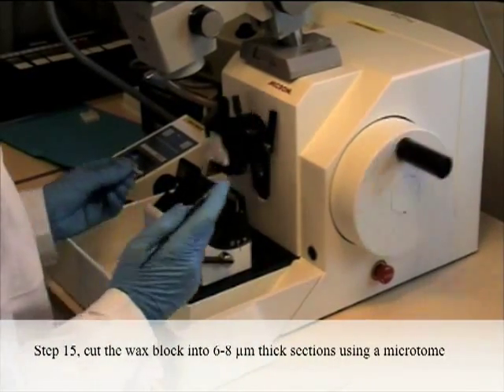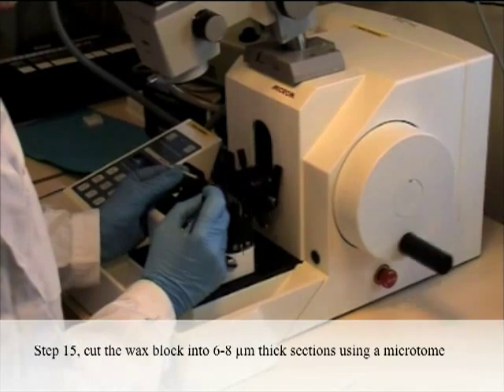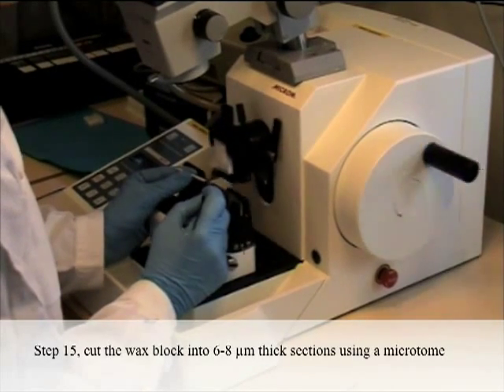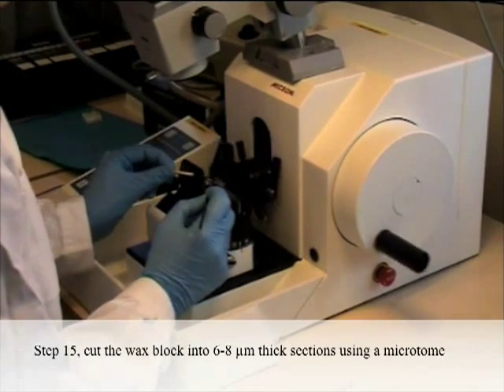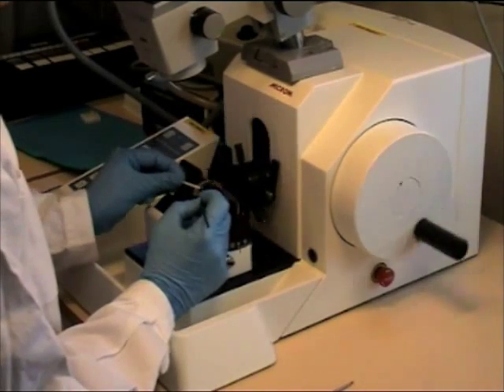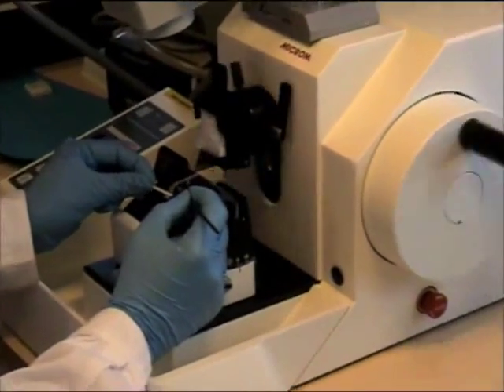Step 15: Cut the wax block into 6 to 8 micrometer thick sections using a microtome. The sections are linked in one long ribbon.